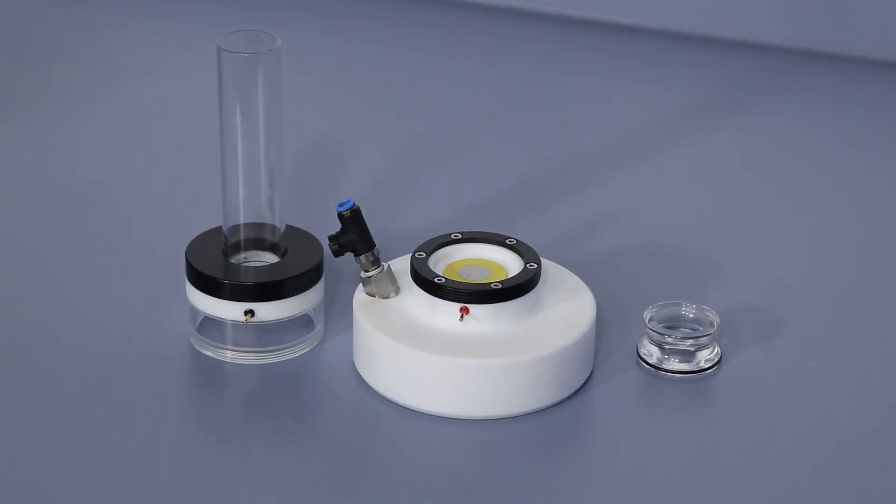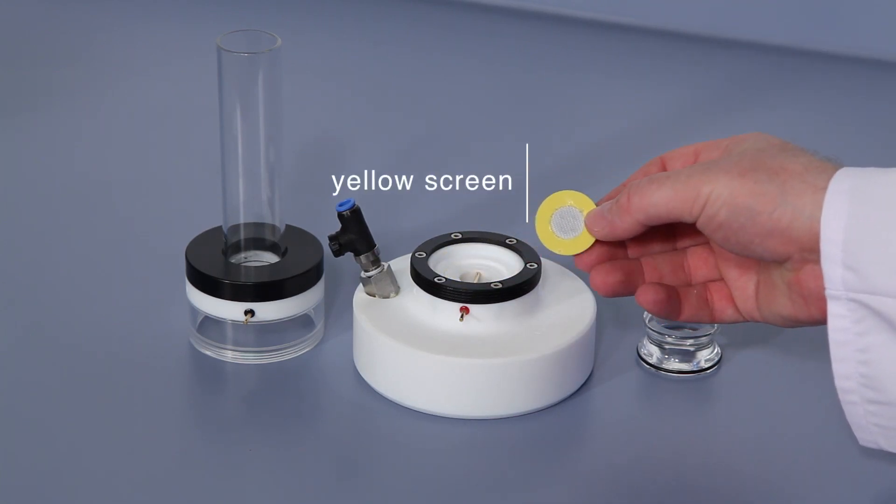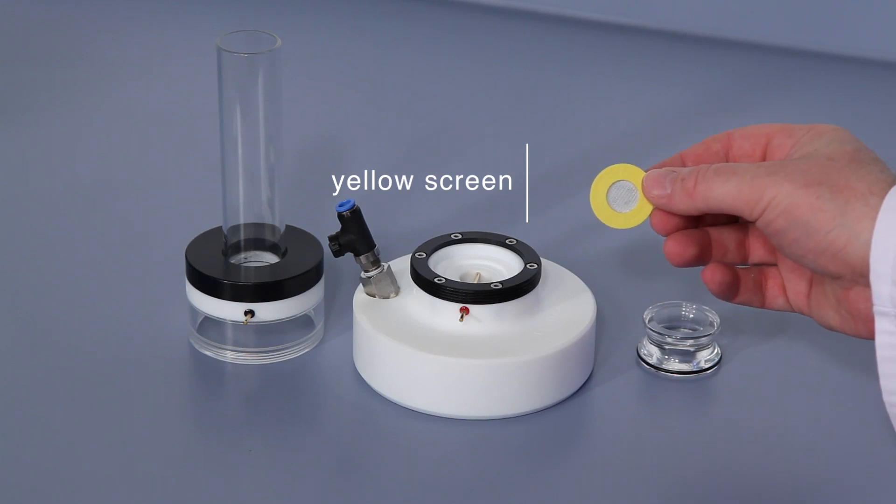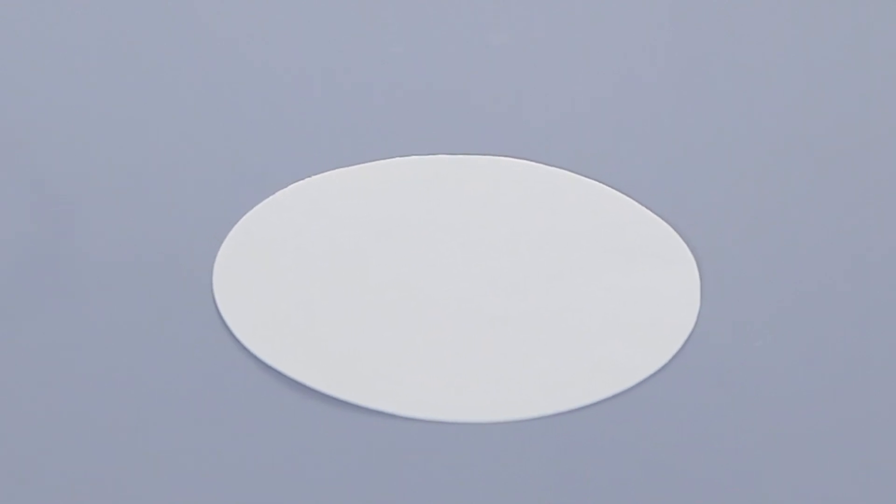The special measuring cell comes with a yellow screen, which works as a supporting structure for a filter paper. You may use any filter paper with a suitable pore size to retain the solids of the suspension to be measured.